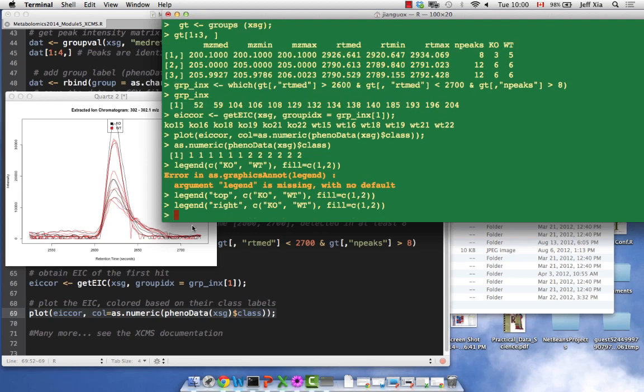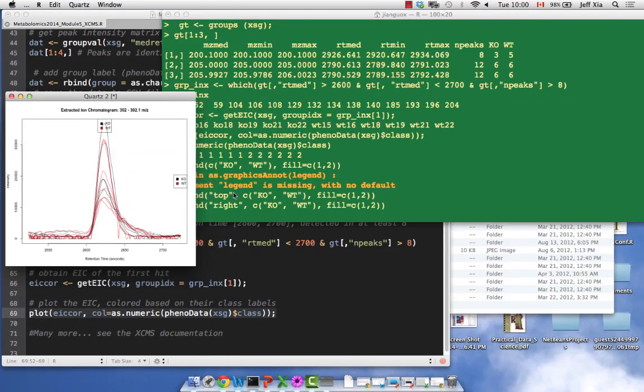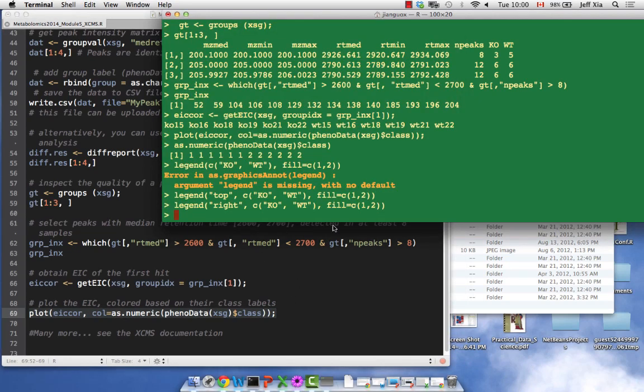But again, this is very basic. See, when you add it to the right, it's here. But there are a lot of fancy ways, advanced options, so search it, and you always find some good suggestions. Because I'm doing a lot of stuff, you need to work a little bit with R, and you know.